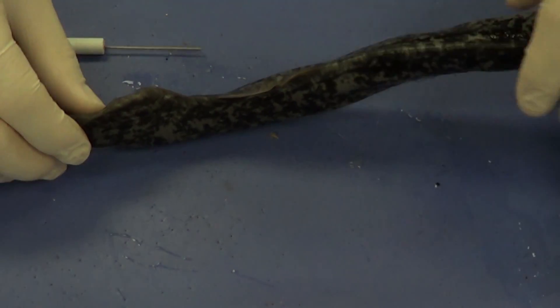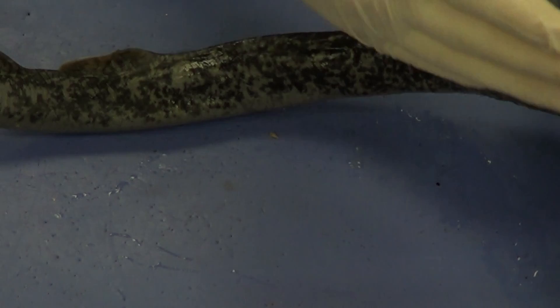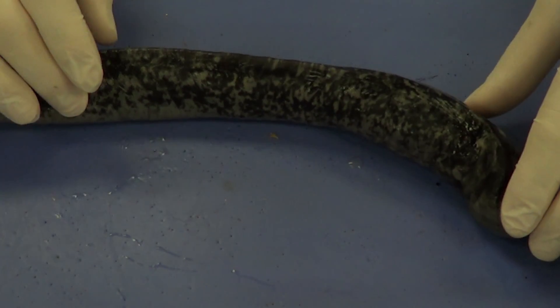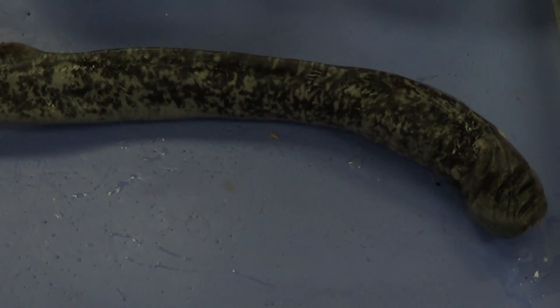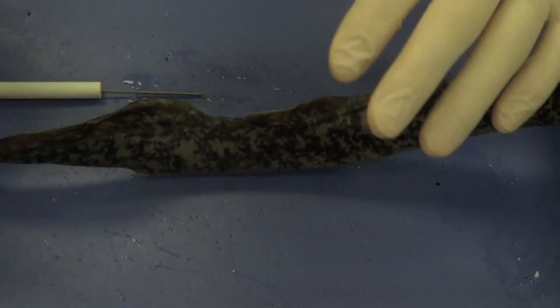It's a single fin down its back, and because of that, the lamprey is going to sort of snake through the water. It's not very graceful like a perch or a salmon, which has paired fins coming off of it allowing better balance and maneuverability. The lamprey doesn't have that — it's a very primitive fish.